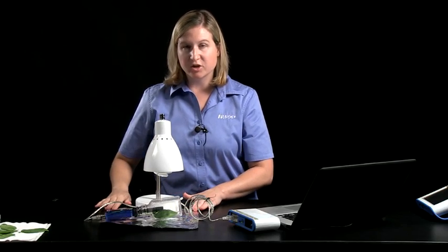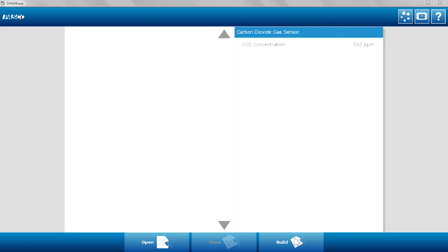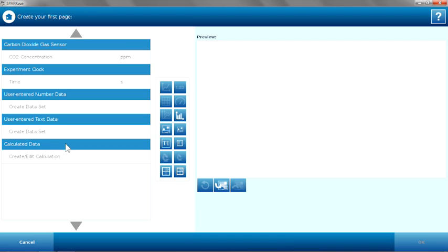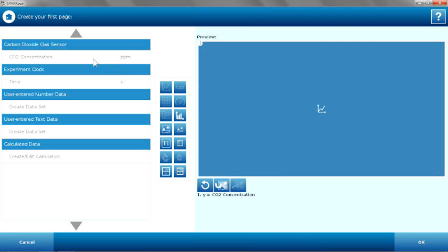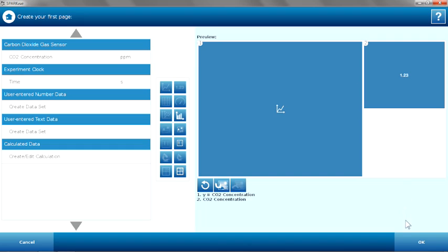Before I begin data collection, I'm going to need to open up a page or build a page in the SparkView program. I'm going to choose Build. My carbon dioxide gas sensor is listed. I'm going to click on CO2 concentration, and I want to create a graph display of that, so I'm going to click on the graph. But I also am interested in seeing a digits display of carbon dioxide concentration, so I'm also going to select the number button here. So we'll be able to see a graph and the parts per million in digits as the data is collected.